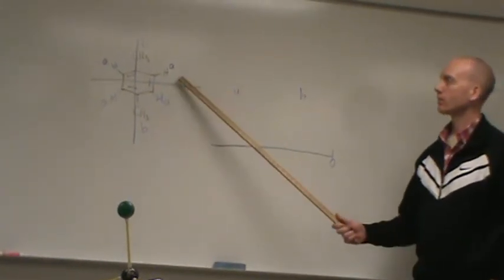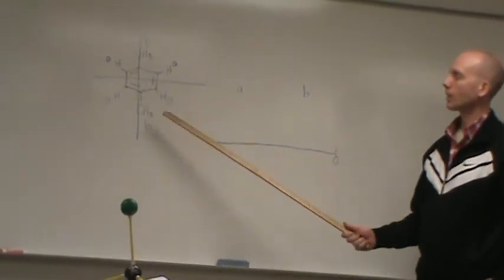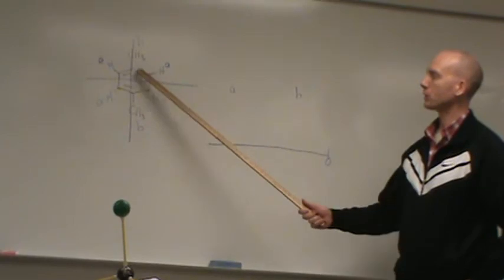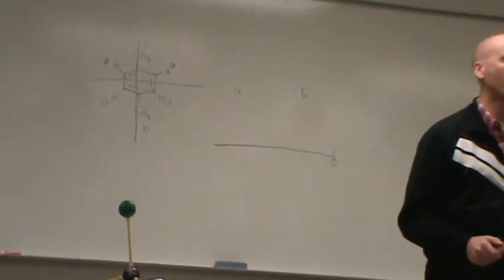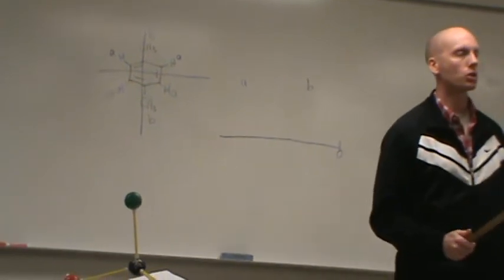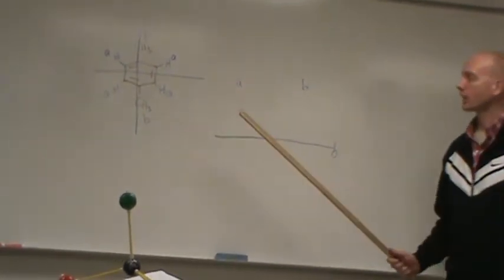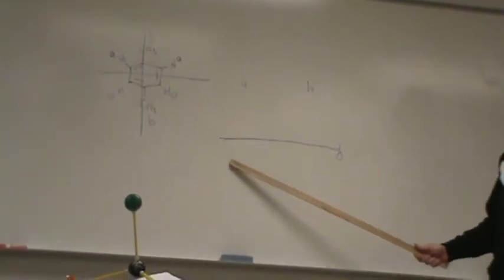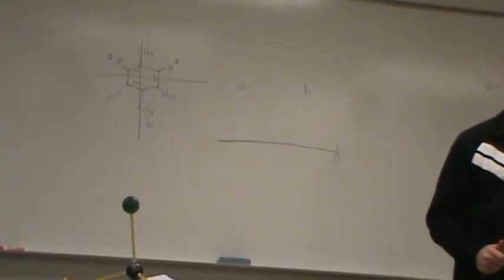Right. So that rule doesn't apply to the ones with the 3 hydrogens or less? No, these are benzene hydrogens. Benzene hydrogens always show between 7 and 8. Okay, CH3s, CH2s, and even regular CHs, they always show more upfield. Okay, so 7 and 8 benzene hydrogens, that's where we're aiming.